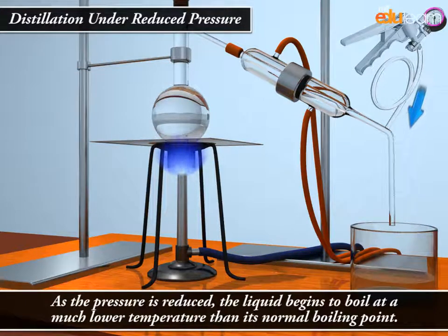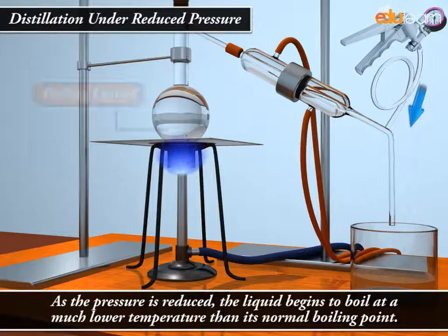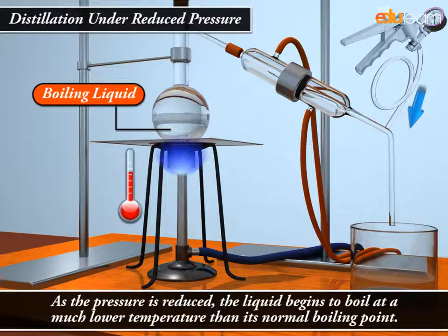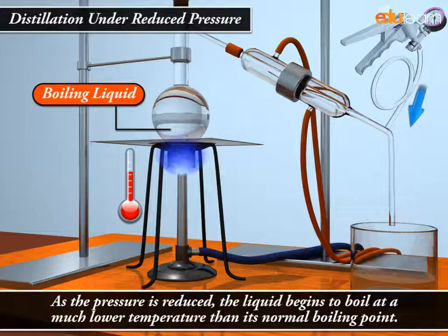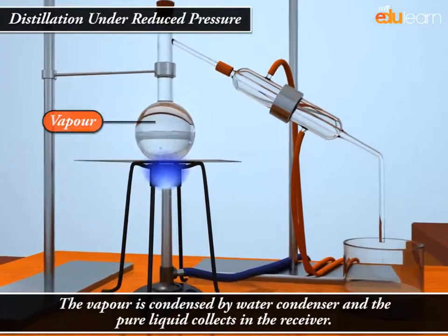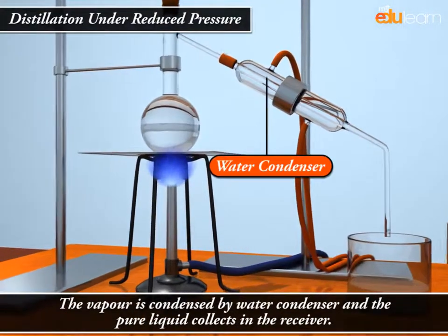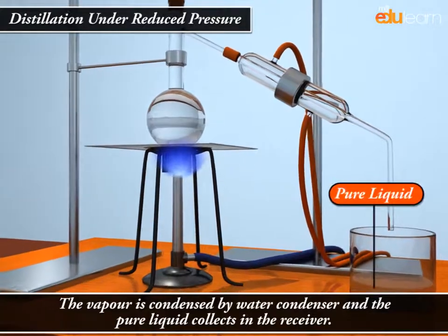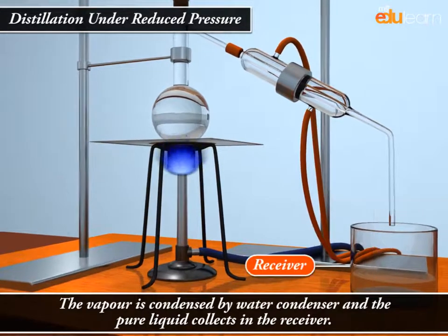As the pressure is reduced, the liquid begins to boil at a much lower temperature than its normal boiling point. The vapor is condensed by water condenser and the pure liquid collects in the receiver.